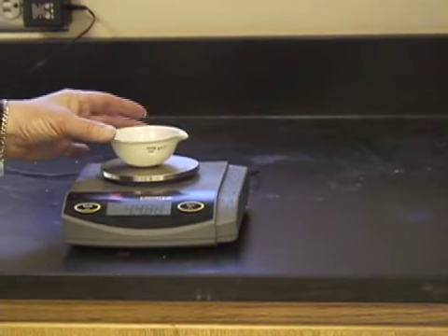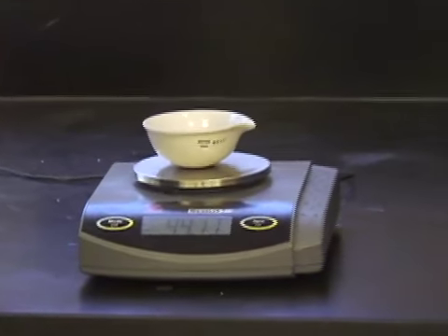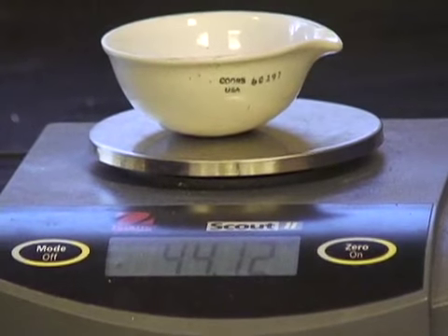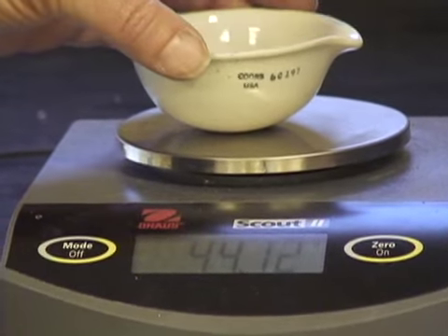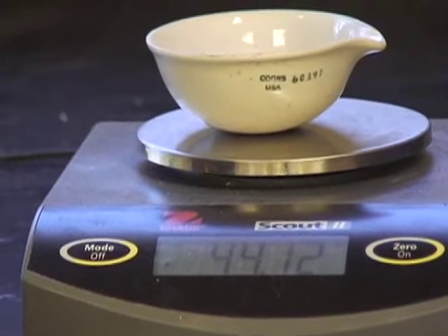And I need to make sure that it's in the center of the pan. And the final mass of my copper is 44.12 grams. 44.12 grams is my final mass of the copper.